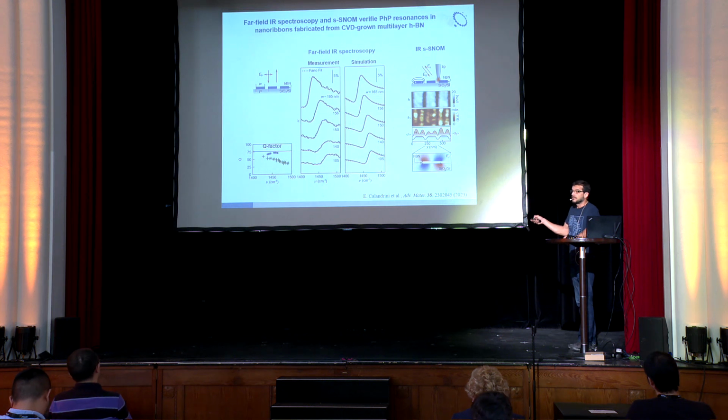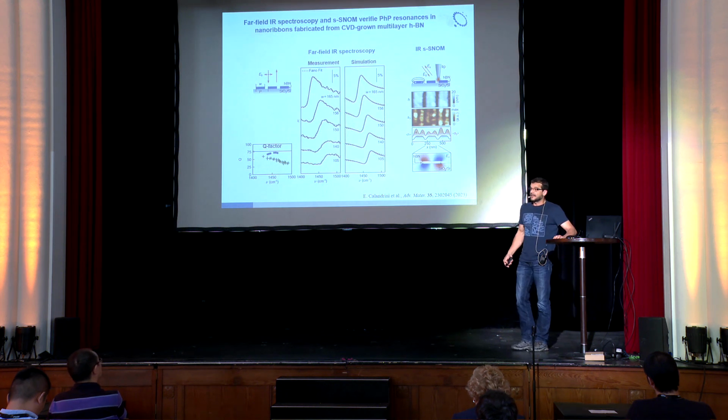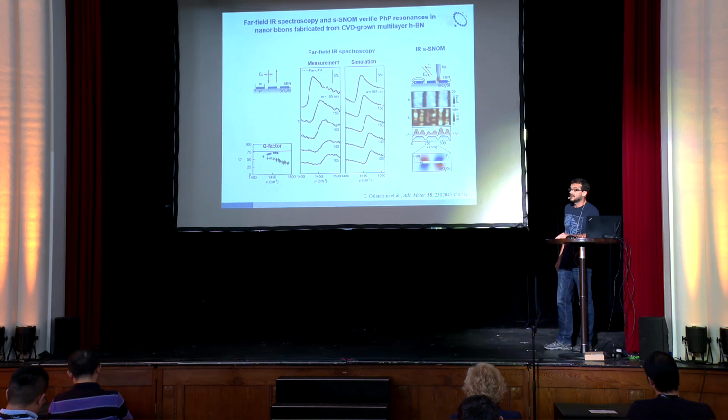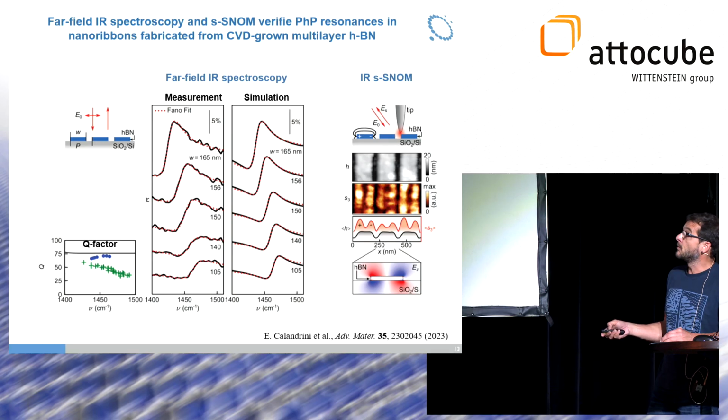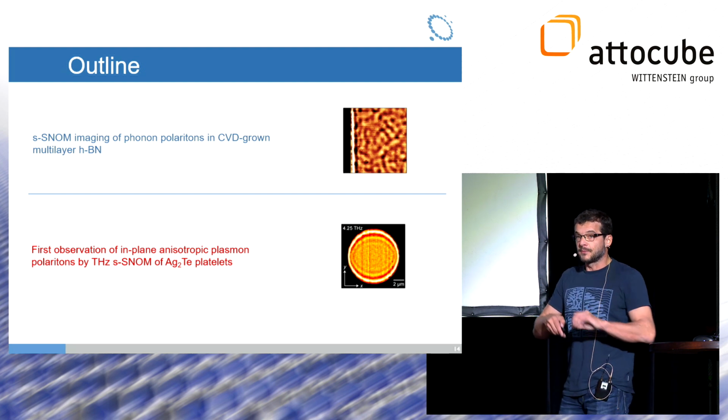So the next step would be to do the whole thing with molecules for sensing. So that could be an interesting step towards, let's say, large-scale phononic resonators. And we used such resonators already for gas sensing, CO2 gas sensing, and there's a couple of more things with which I cannot talk at the moment. And so, yeah, that's potentially interesting. And with the s-SNOM, actually, we could learn a lot about the materials. We can not only study polaritons, but we can eventually also use that to learn maybe about defect distribution and so on.